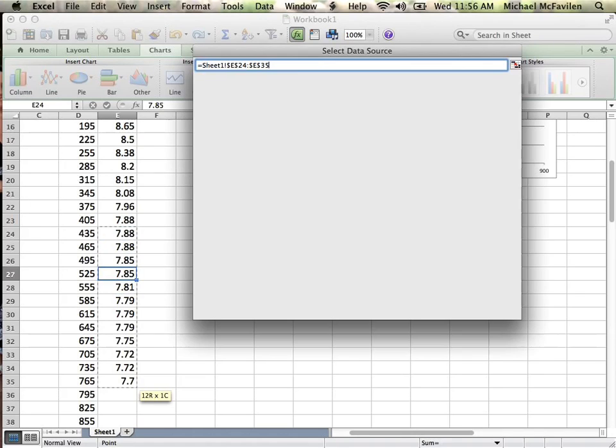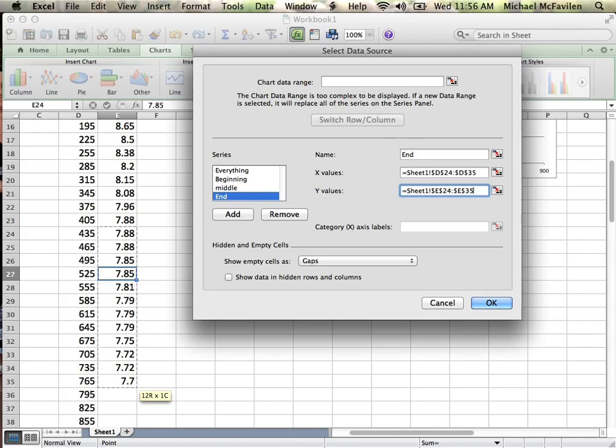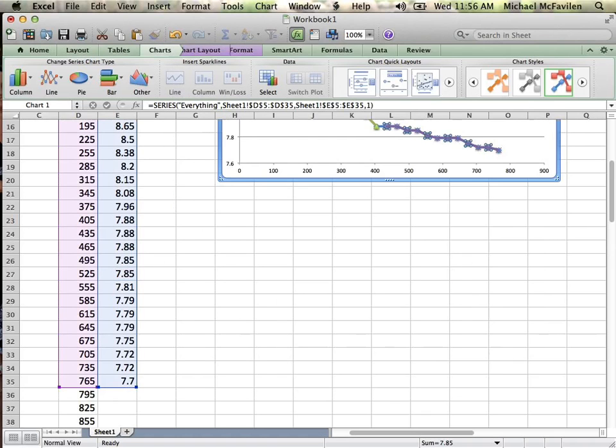435 across. Any questions about anything we've covered so far? Kind of makes sense? Okay. You're probably lucky that you're watching this, because you can't see the cursor in the video. Sorry for those of you watching the video.